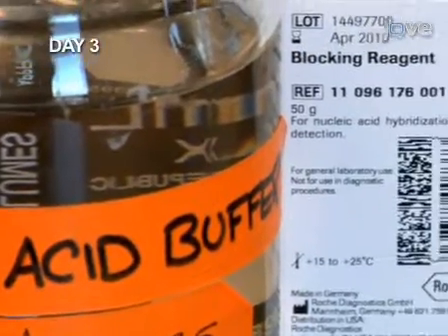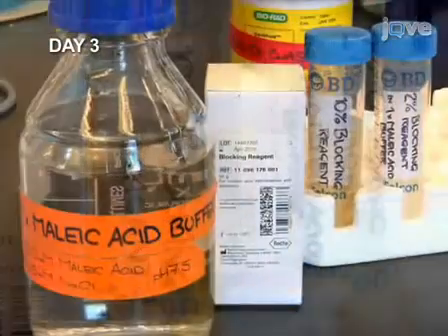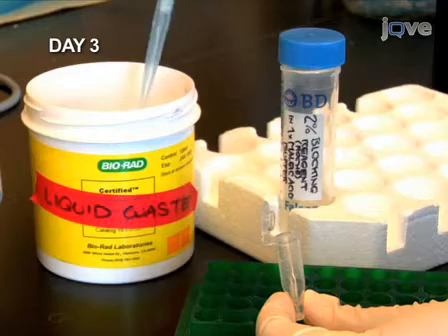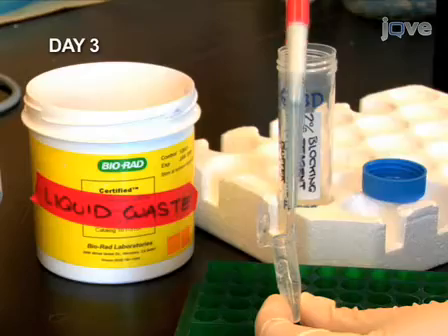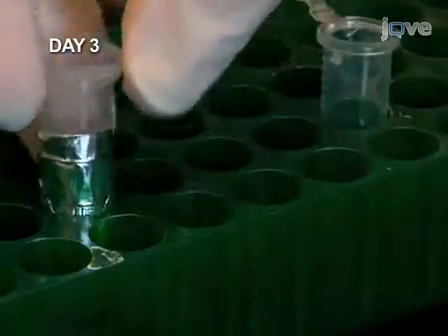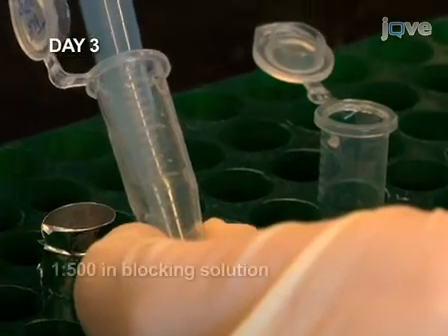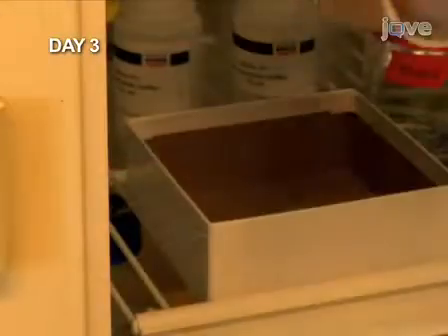Now we can begin detection of the hybridized probes. Detect the fluorescein probe first, because it is less stable and weaker than the digoxygenin probe. First, block with 500 microliters of 2% blocking reagent in maleic acid buffer for 1 hour at room temperature. Next, add the peroxidase-conjugated anti-fluorescein antibody at a 1 to 500 dilution in the blocking solution. Incubate overnight at 4 degrees Celsius.